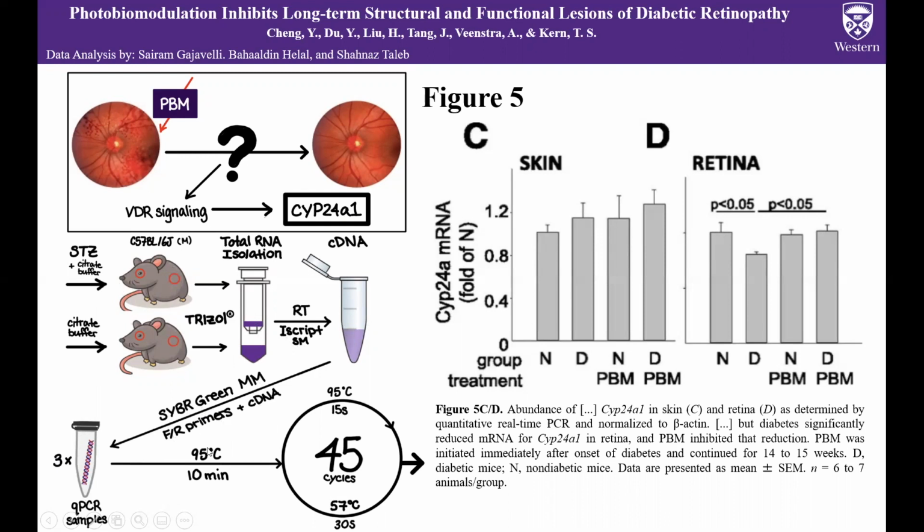PCR conditions were set as per the manufacturer's instructions, and relative quantification was achieved using the fold change formula and normalization to beta actin. Despite the lack of mention of quality testing, and therefore the potential for confounding variables, the authors' transparency in disclosing the qPCR protocol promotes reproducibility.